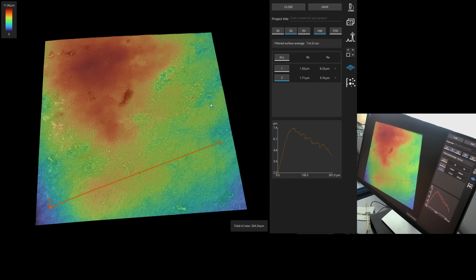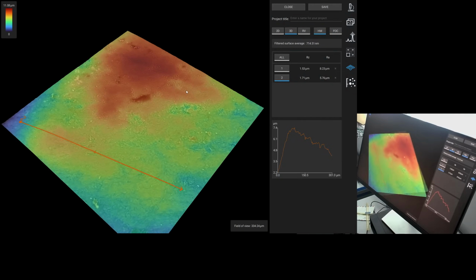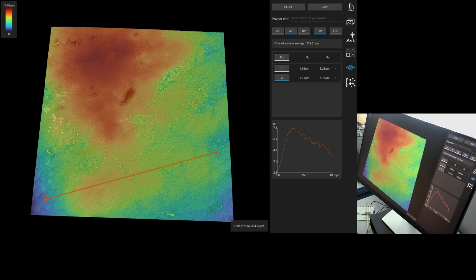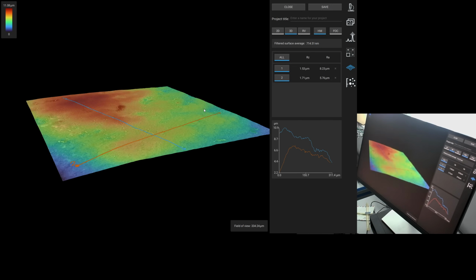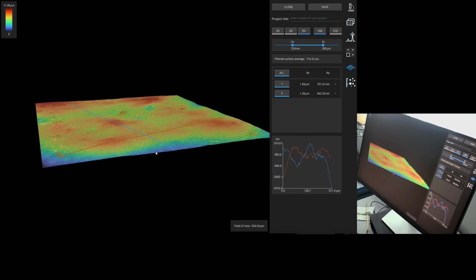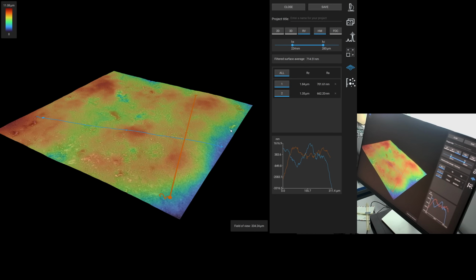Okay. There's not a lot of marks of sort of linear polishing here. Now one wonders whether certain elements have dissolved out over time and it was actually flatter to begin with. There we go. Not a lot of difference there. In fact, I've adjusted for the overall slope of it, so it's going like that. And you can see the difference is even less.